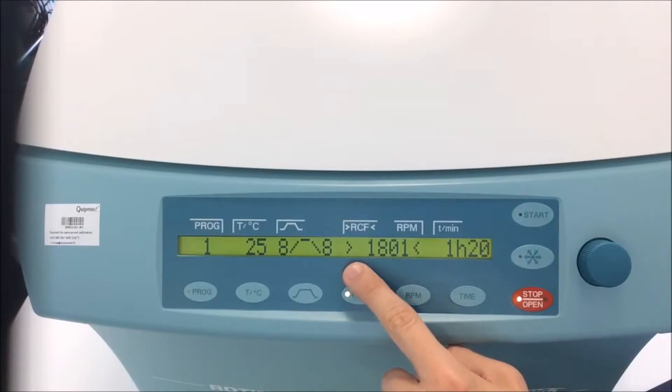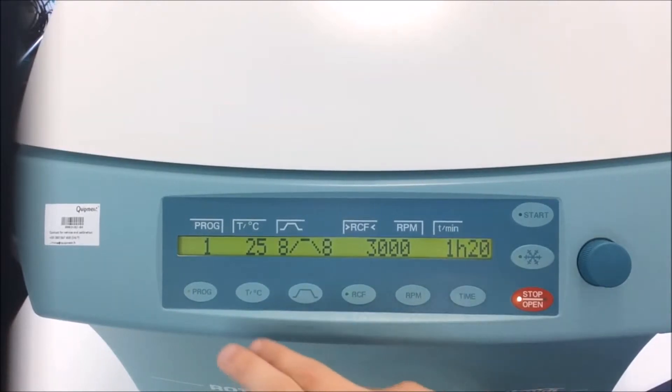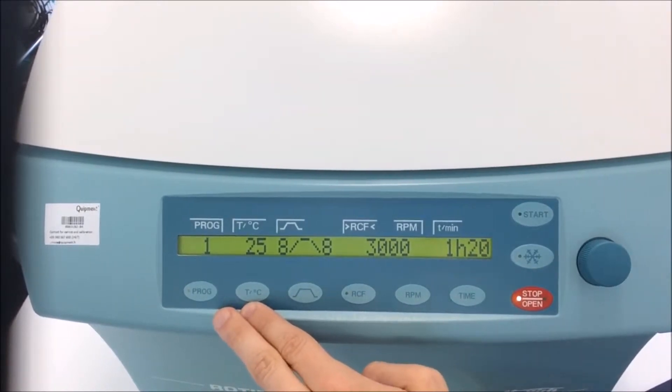My speed in RCF is 1800. I can change it, of course. And the duration of the centrifugation is 1 hour and 20 minutes. Of course, I can change any parameter I want.